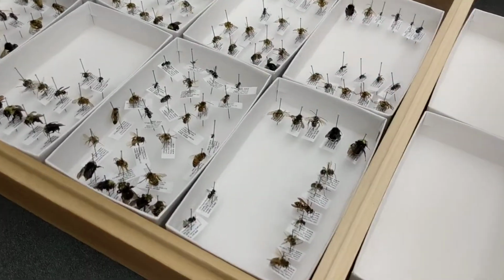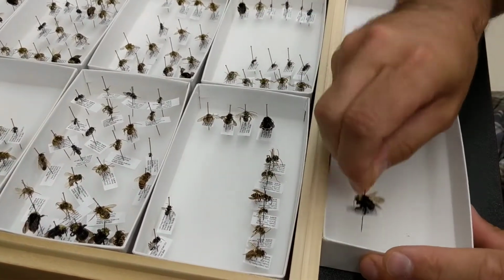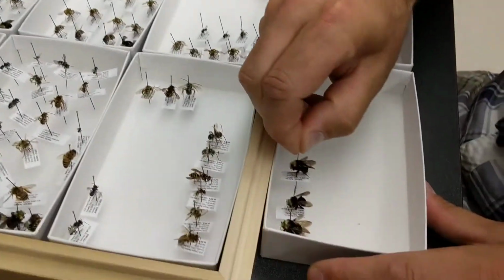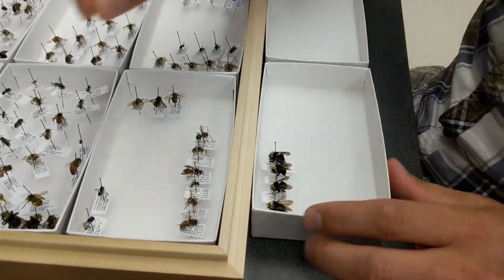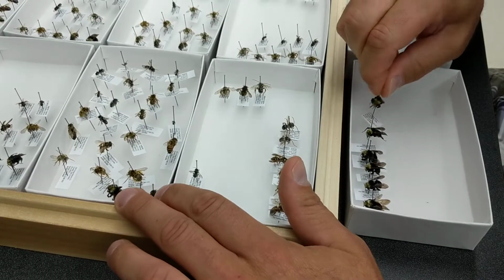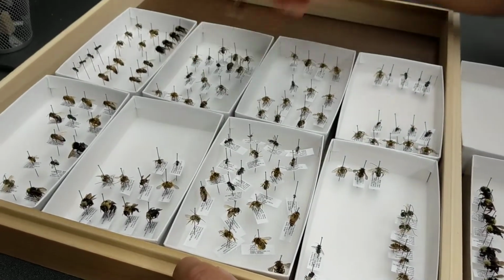Just looking at these, the first thing I'm going to do is pull out all the things I think are bumblebees. So we've got these ones, big fuzzy bees. If you attended the bee course, you know that female bumblebees have a corbicula. So we'll pull out all the bumblebees. There's maybe a couple dozen or so. You get the idea. So maybe I won't pull them all out, or maybe I will. It's not too many.